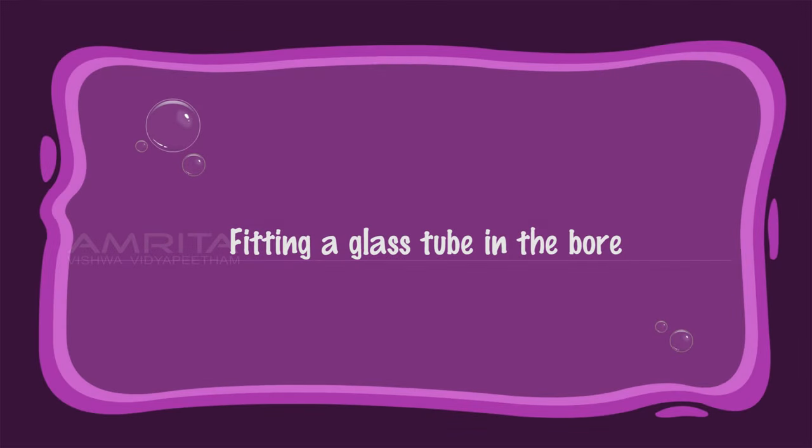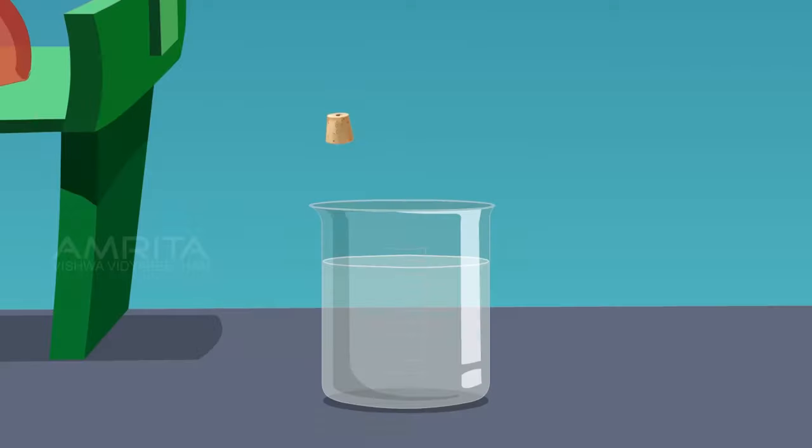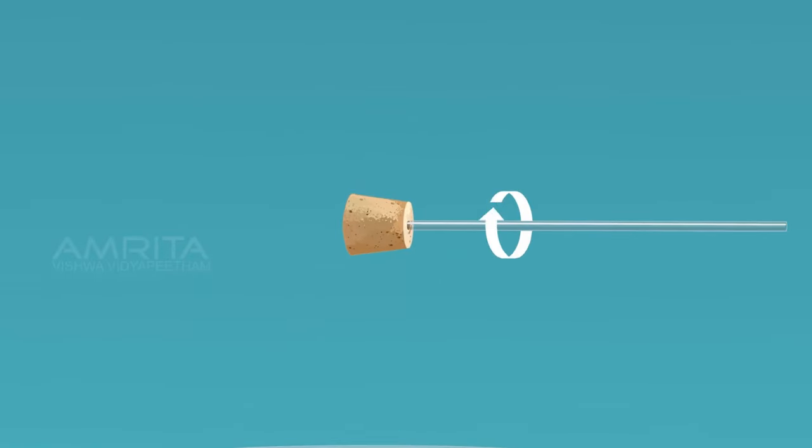Fitting a glass tube in the bore: Dip the bored cork in water. Take a glass tube and wet the end of the tube with water. Insert the tube into the bore by rotating it.